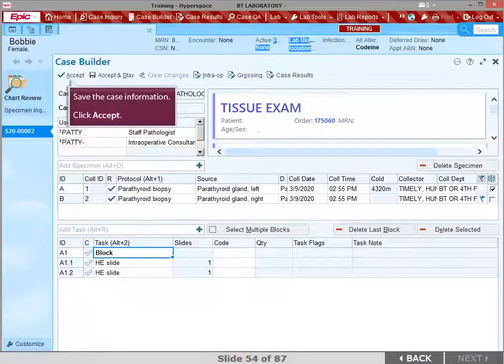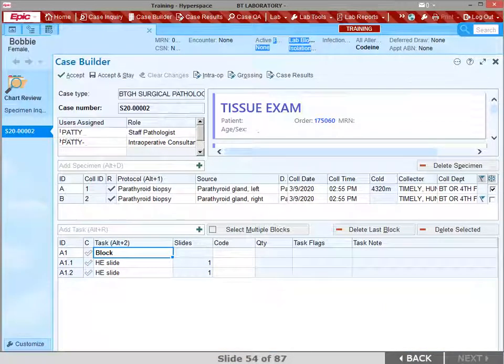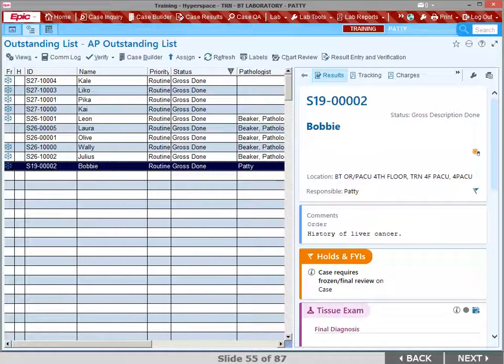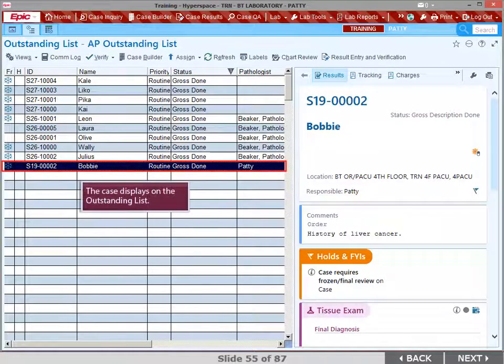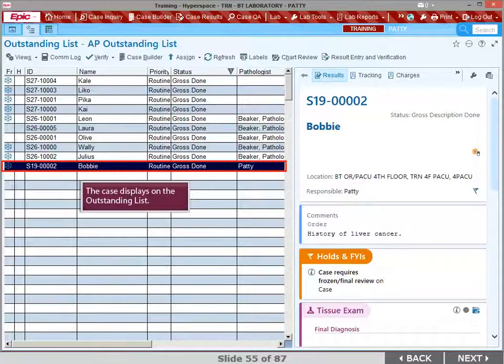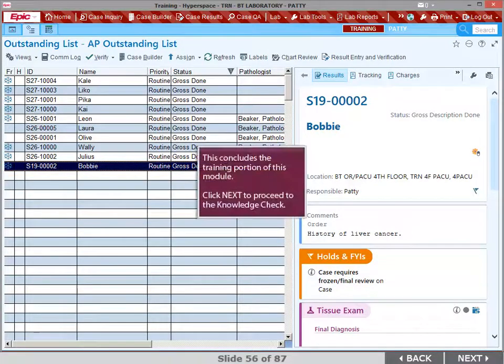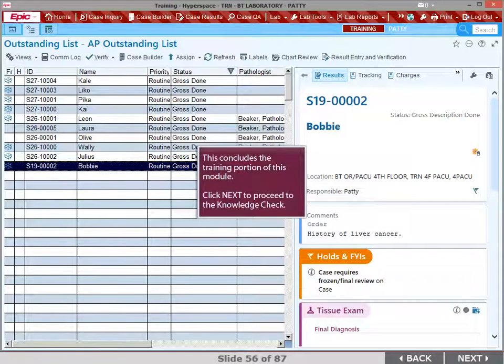To save the case information and send the case to the Outstanding List, click Accept. The case displays on the Outstanding List. This concludes the training portion of this module. Click Next to proceed to the Knowledge Check.